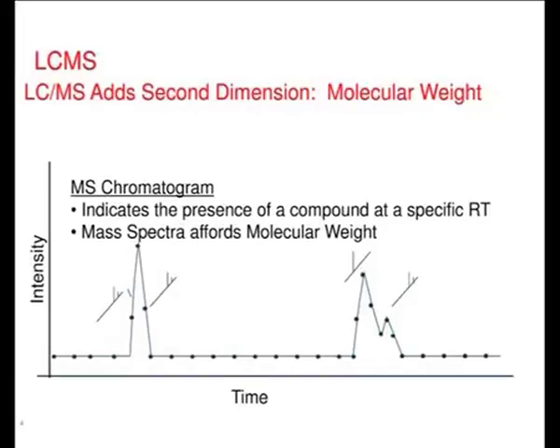For example, you are analyzing a small molecule from a matrix like plasma. The molecular weight of your compound is 490. You are getting a particular retention time, for example 2 minutes. You are getting an m/z of 491 or 489: 491 in positive and 489 in negative, based on protonation and deprotonation.